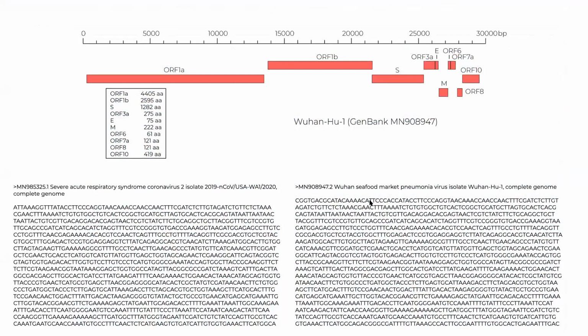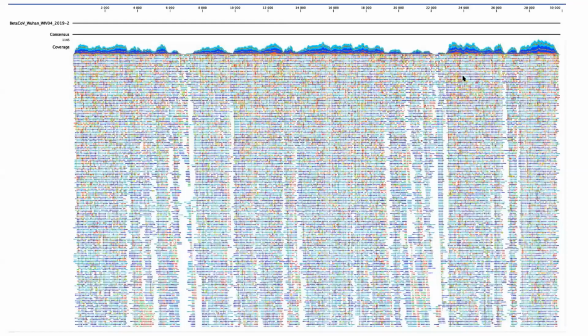What do the peaks in the coverage region signify? So the peaks are associated with the number of reads. Coverage is the number of reads that are aligned to that particular position. So if that coverage is higher, that means more reads aligned to this region. If the coverage is much smaller, maybe there are not a lot of reads aligned to that.